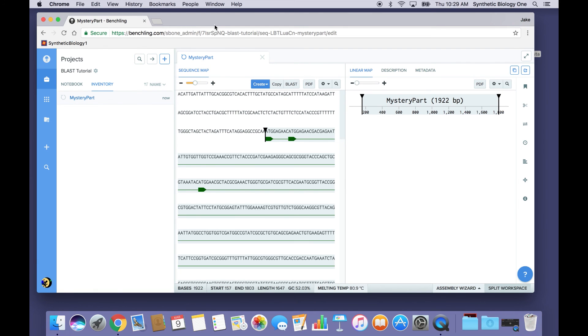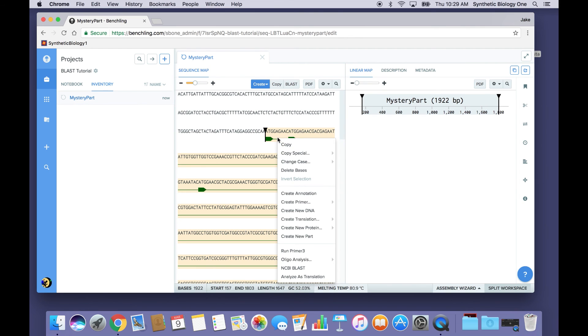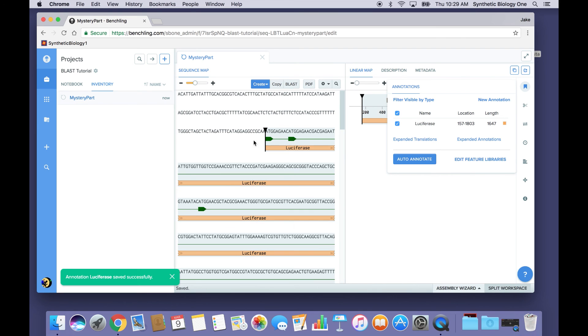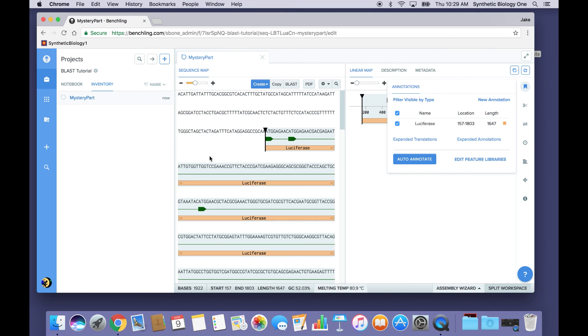So now with that knowledge in mind, I can go to this ORF that I've blasted and I can say create annotation. And I can call this what it is, which is luciferase. And there you have it, a very mysterious DNA sequence made slightly less mysterious with the help of blast.